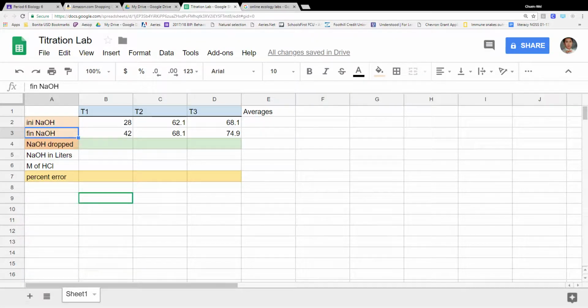Hello class, it's Mr. Ng and I'm here to show you how to manage your titration numbers in Google Sheets. Namely, I'll be showing you how to set up your equations and how to use equations in Sheets.